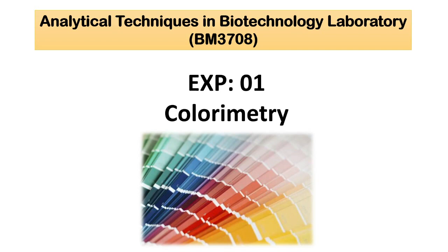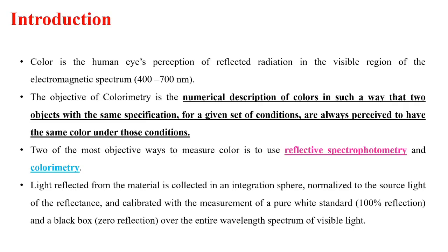Okay, welcome everyone. Myself W Sav. So I'll be taking you through this first experiment. It's about colorimetry. As sir already explained, how colors are important for this biotechnology aspect. So I'm directly going into the theoretical part of it.